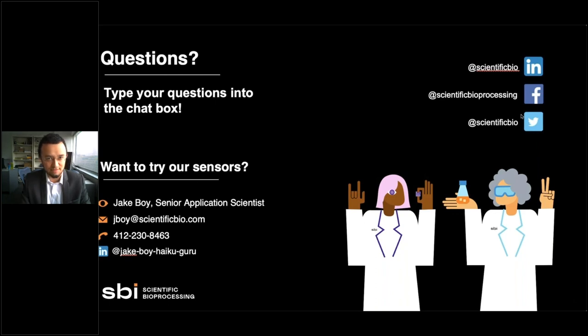Signal transduction. I'm not a signals guy, but Jake, do you have any info on that? So if you're talking in terms of the sensors, I'm not really sure what you mean by signal transduction in this context. I don't know if you're still around to possibly clarify that, but if we're talking about the sensors, the method that we use is a quenching of fluorescence. So they're fluorescent dyes embedded in the sensors, and then based on the presence of oxygen, that signal will decay at a faster rate. So I don't think that's what you meant, but that's the closest thing I can get to.